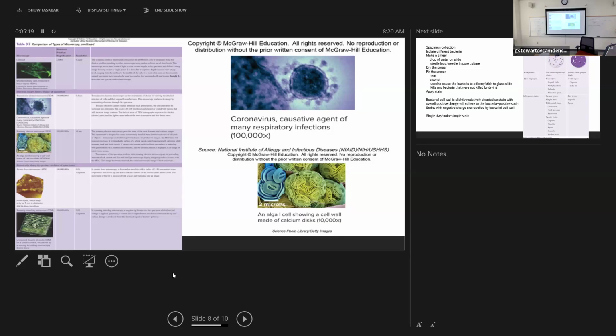Usually you have to be a specialized operator in order to use the electron microscope because it's complicated. There's a lot of computer parts that go with it. And the staining procedure is much more intensive. That's going to take you 3 to 5 days of lab time to actually stain the specimen. And then you need someone who, in the case of a transmission electron microscope, can slice it ultra thin on a machine called a microtome. All right. So I'm going to put particle, let me spell that, particle form of light.